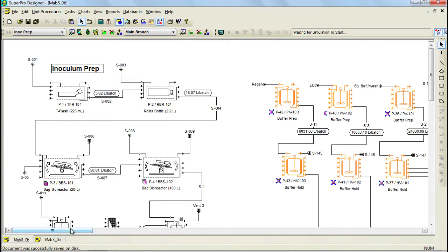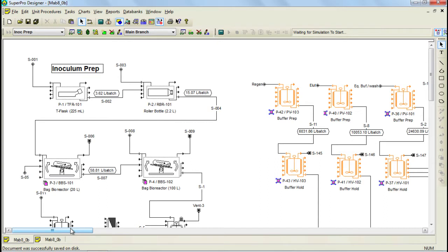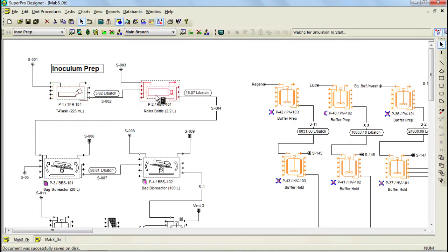A section in SuperPro is simply a set of related unit procedure processing steps. The upstream section is split into two subsections, the inoculum preparation section and the bioreaction section. The inoculum preparation groups all the steps that are included during cell expansion prior to the main bioreactor activities and begins with the preparation of inoculum in T flasks, continuing on to roller bottles, and subsequently into disposable bag rocking systems.